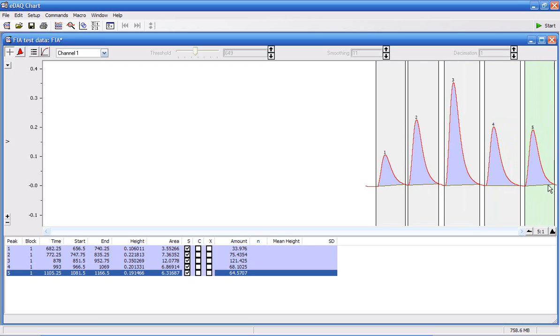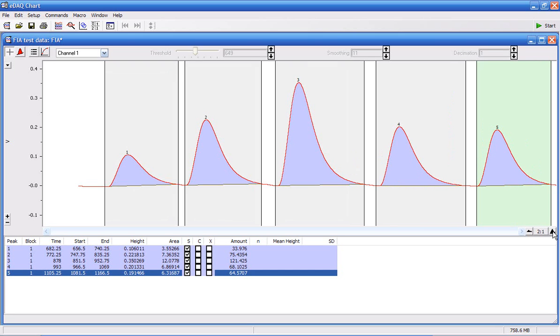So I've done that for the five peaks. You can expand the x-axis using these buttons here.